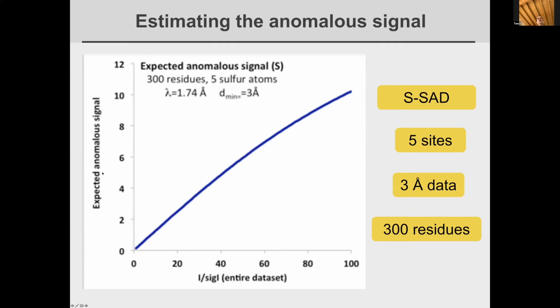Suppose your typical isomorphous replacement experiment is going to be something like a couple of mercuries in a few hundred or 1,000 residues. And those mercuries are going to cause isomorphous differences on the order of 20 or 25%. And maybe you have errors in measurement of 10 or 15%, and that's okay. You'll still solve that structure. So it's a very different situation than the selenomethionine or sulfur type situation.